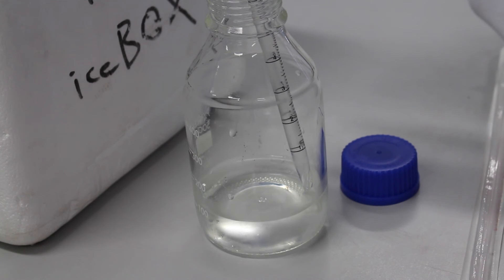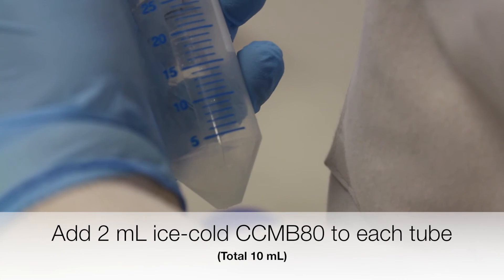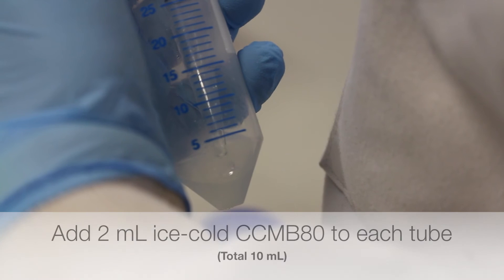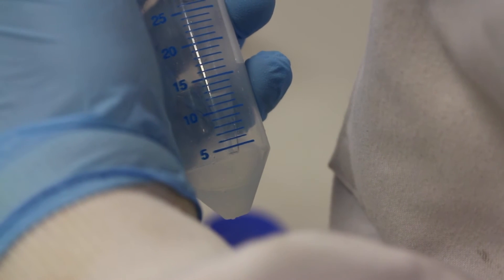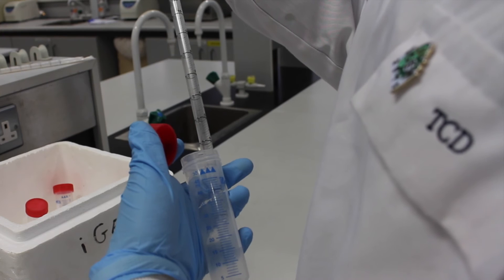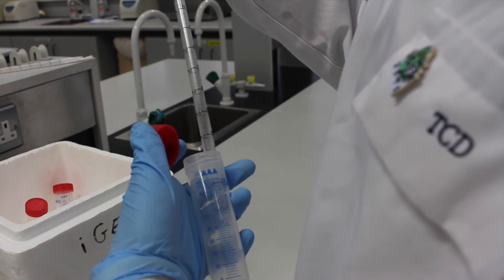The pellets are re-suspended by adding 2 ml of ice-cold CCMB-80 buffer into each tube. If using multiple containers, such as in this video, combine the cells post-resuspension.